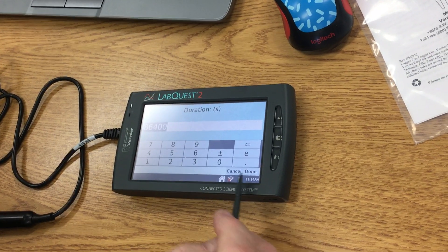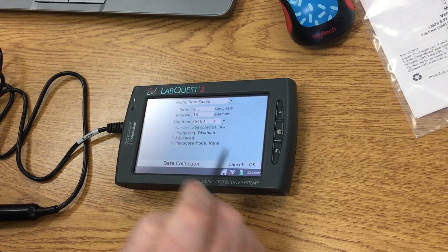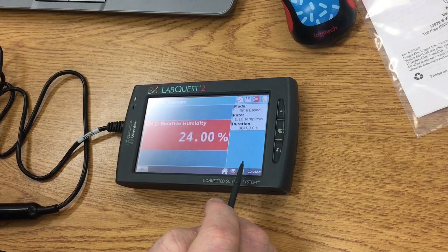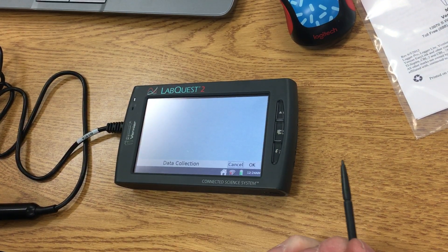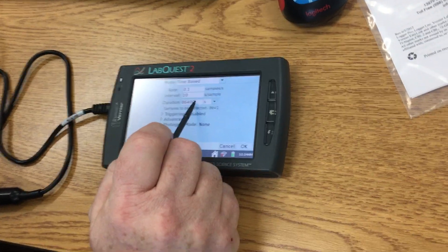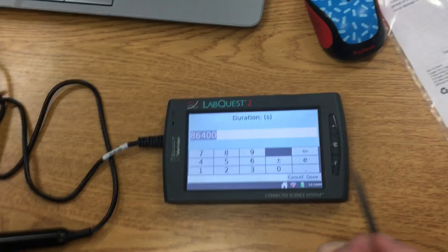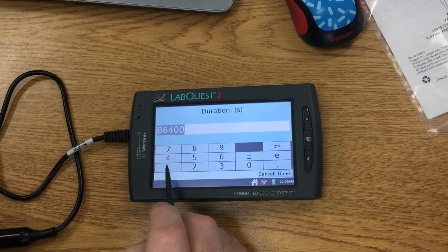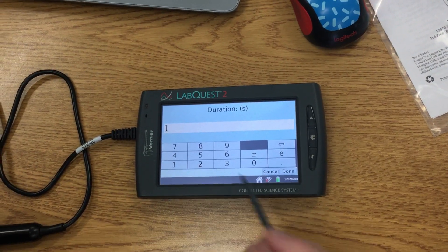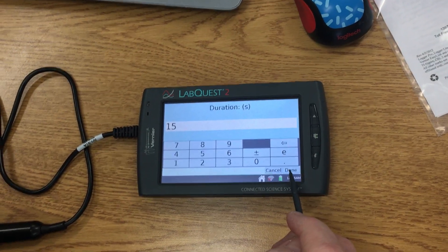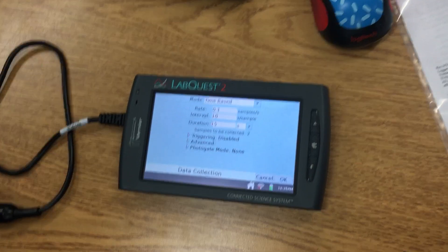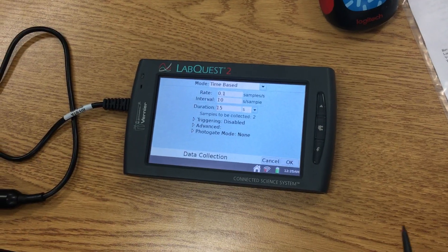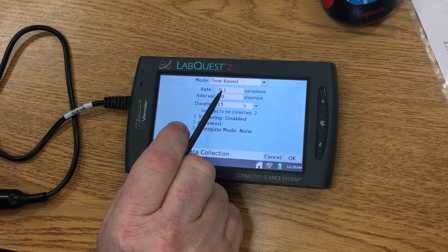I'm going to click on the time right there and I'm going to change it to 15 seconds. Then I'm going to click on Done. When that's done, notice it says I need to change my rate because I'm only going to get two samples, that's not enough.